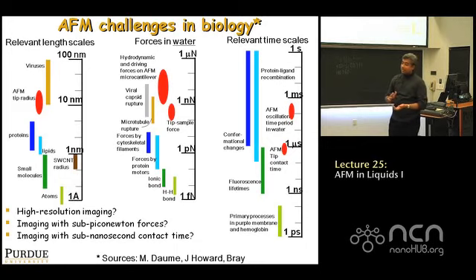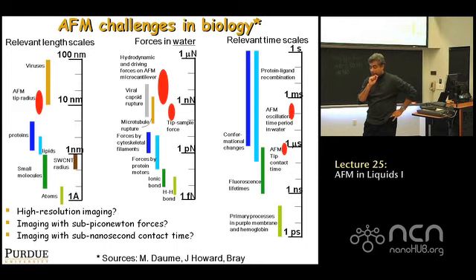This does become an issue because when you do FZ curves pretty fast in water, it's not a clean straight line where you hit the sample and then something happens. You actually get hydrodynamic drag effects, so when you approach the sample, even before you contact, there is quite a lot of bending. Then you contact and there's some force, and when you come back, it bends the other way, because when you come back it's bending down. When you go down, it's bending because of hydrodynamics. And so that causes a very major distortion of a standard FZ curve.